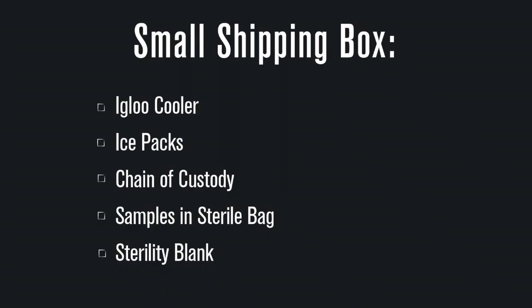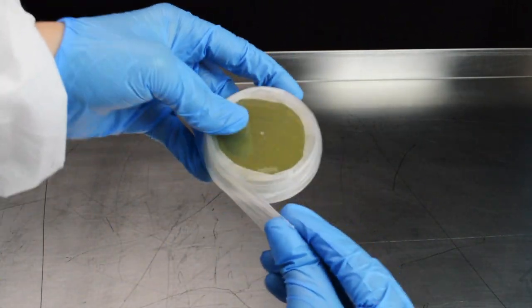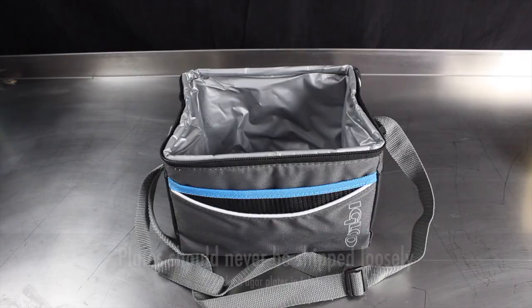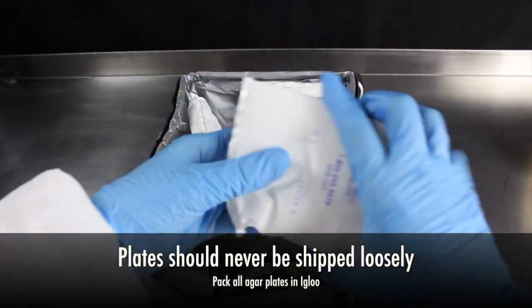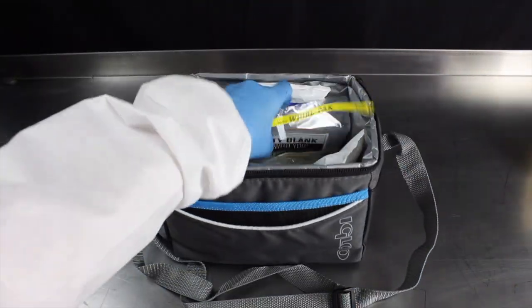The small box, as well as the cooler, will safeguard your samples. Make sure your plates are locked, labeled according to your chain of custody, parafilmed, and placed into the provided sterile bags. Spread the frozen ice packs evenly throughout the insulated cooler, ensuring even contact with your samples. Don't forget your sterility blank.